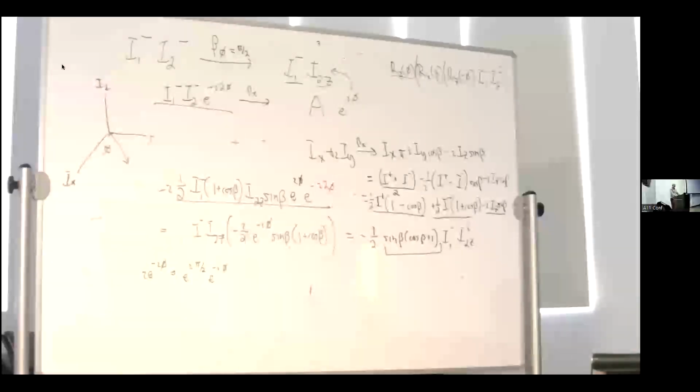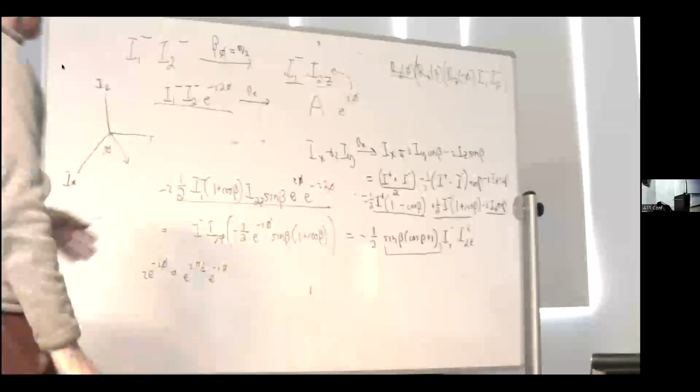But then again, you'll end up having to figure out what beta is by generating some trig terms and then doing calculus. But one of the tricks, and this comes up all the time as we analyze pulse sequences here.